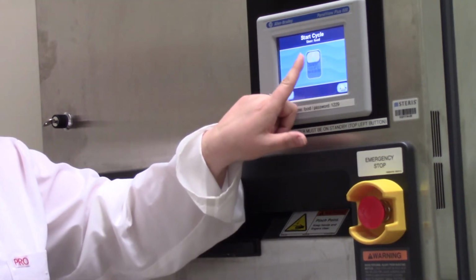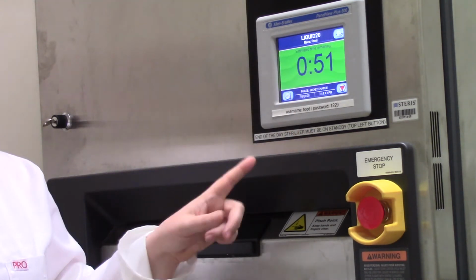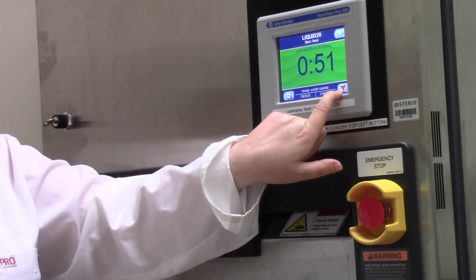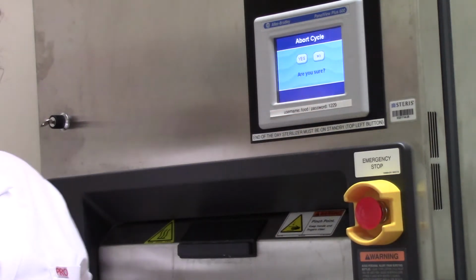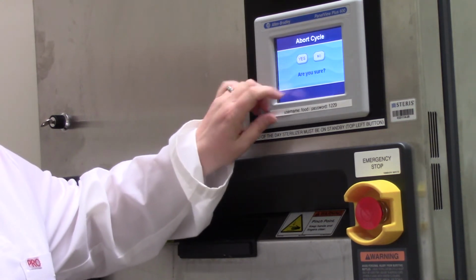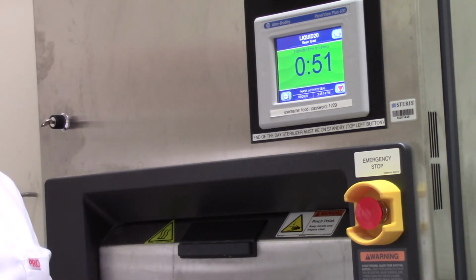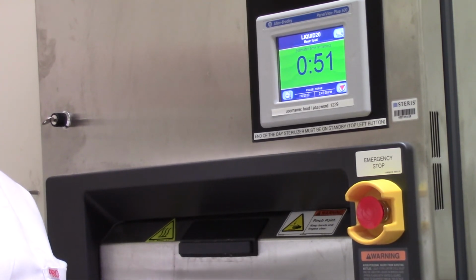So let's just go ahead and select our cycle and we'll get it going for you. That is the stop button, the red triangle. All right, and if I do that, it will actually tell me whether or not I want to abort the cycle, and I actually don't. I want to run my cycle, so that's going to keep going. All right, it's about to get loud, so we'll wrap up here, and we'll see you back for showing you how to unload the autoclave.